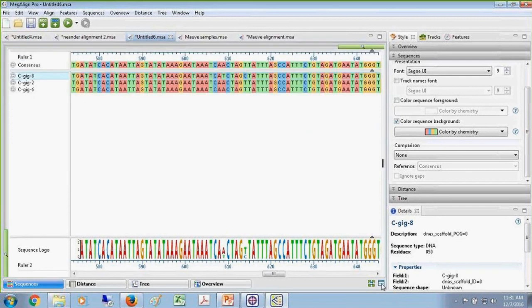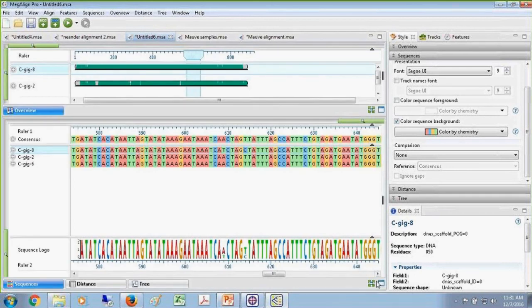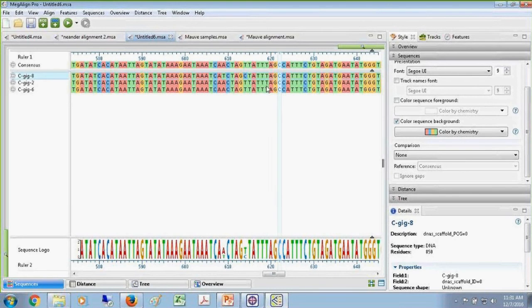Here I've moved down to this little corner. I'm going to click on it again. I can return back. I can toggle on and off. Remove the split view. It's essentially removing the upper pane temporarily, just kind of like minimizing it.